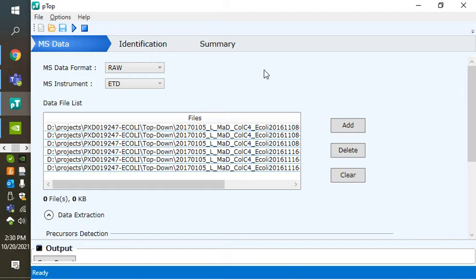I wanted to specify that I'm working with version 1.2, which is not the pTop 2 release that they're currently working toward. I would say that the software development on pTop is at the moment not really in motion. So if you want to download a tool that isn't going to be changing every week, pTop 1.2 is actually a pretty good option for you.